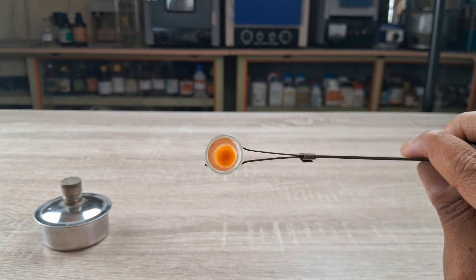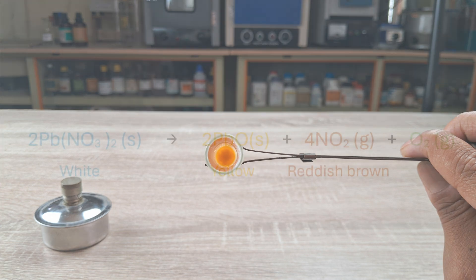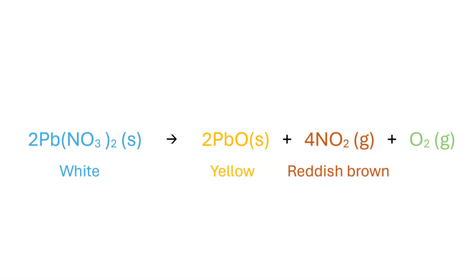Eventually, the release of the brown gas ceases, and what is left in the test tube is a yellowish-brown residue of lead monoxide. The chemical equation for the thermolytic decomposition of lead nitrate is as shown here.